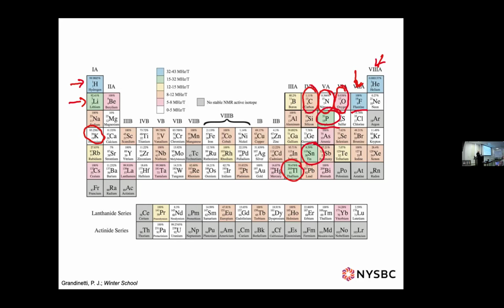In most cases, people who have done those studies have done them on single channel probes that don't even have a proton channel, just X. If you're looking at something like tin or thallium, you probably don't have a lot of protons around, so you don't have to worry about decoupling the protons like we always think about. You don't need the proton channel; it's not adding anything to the game.